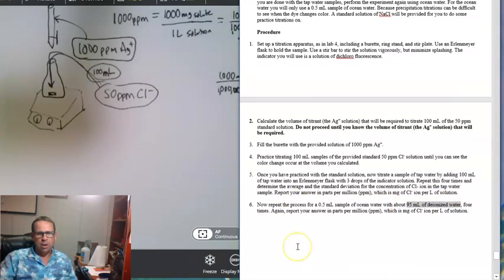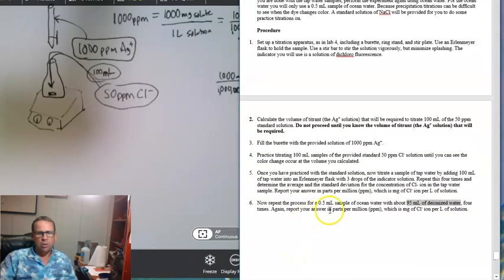Okay? And you want to make sure you do that, and you're going to report your answers for the concentration of chloride ion of the tap water, and also the concentration of chloride ion for the ocean water in parts per million.